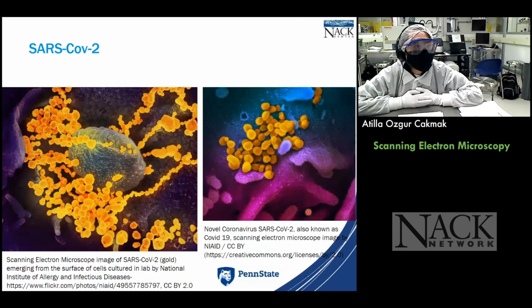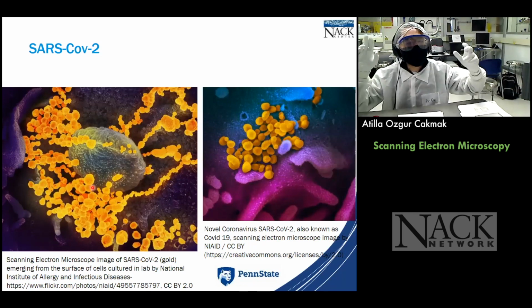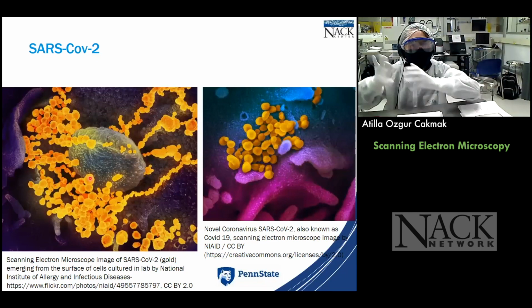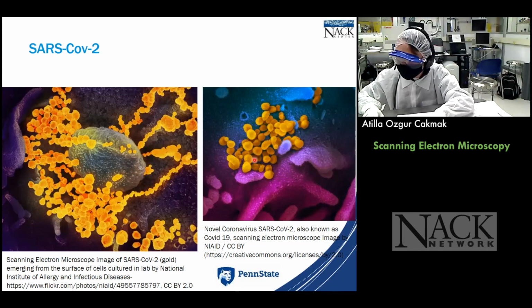So now let's relate it to the current discussions that we encounter on a daily basis. How is it useful? Wes will talk more about it, to image, let's say, SARS-CoV-2 or COVID-19. You can see more images from the sources here, but this is an infected cell, and that was stained electron microscopy. I don't know the details about biological imaging, honestly. I'm more from the semiconductor or physics background, but they were able to see the coronavirus located around the cell structures.